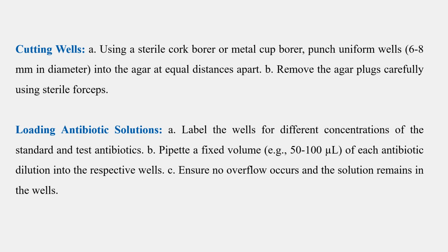Loading antibiotic solutions. A. Label the wells for different concentrations of the standard and test antibiotics. B. Pipette a fixed volume, e.g., 50 to 100 microliters, of each antibiotic dilution into the respective wells. C. Ensure no overflow occurs and the solution remains in the wells.